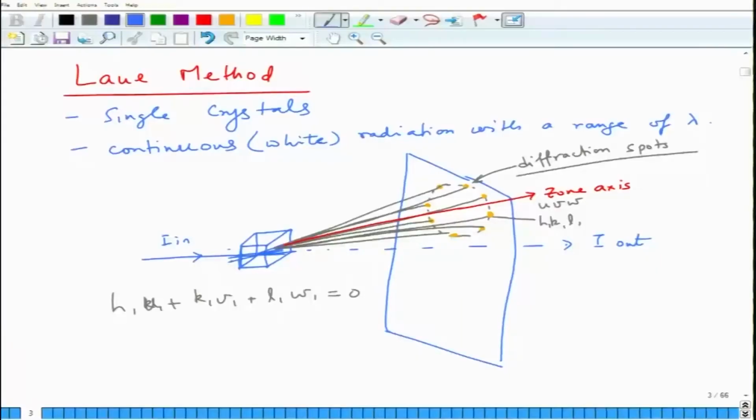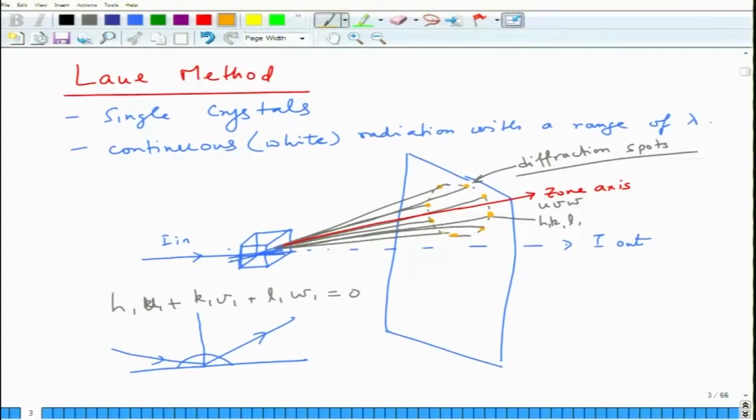So that is what it is going to look like. For angles which are smaller than 90 degrees, you will have a forward coming diffraction pattern. So you can see that if this is your Bragg angle and this is the incident beam, this is your forward coming beam. For higher angles the peak will go on the back side, because this angle is 180 degrees, right. Anything for which 2 theta is less than 90 degrees, you will have diffraction on the forward side, and for anything which has a diffracted peak having 2 theta more than 90 degrees, it will go on the back side.